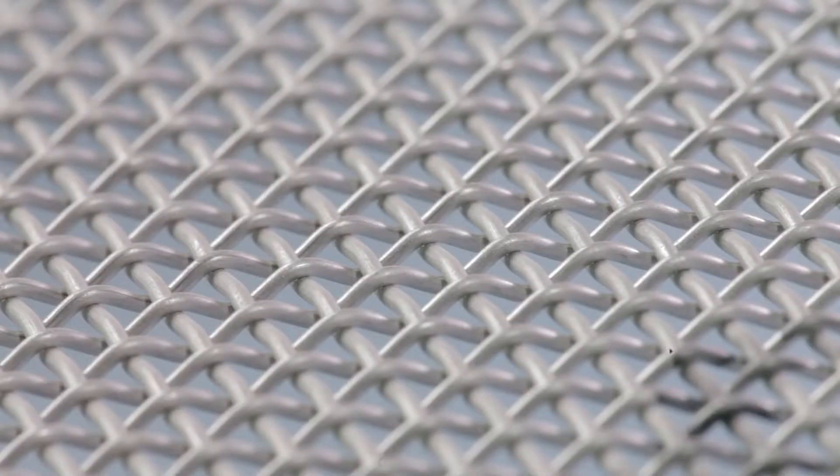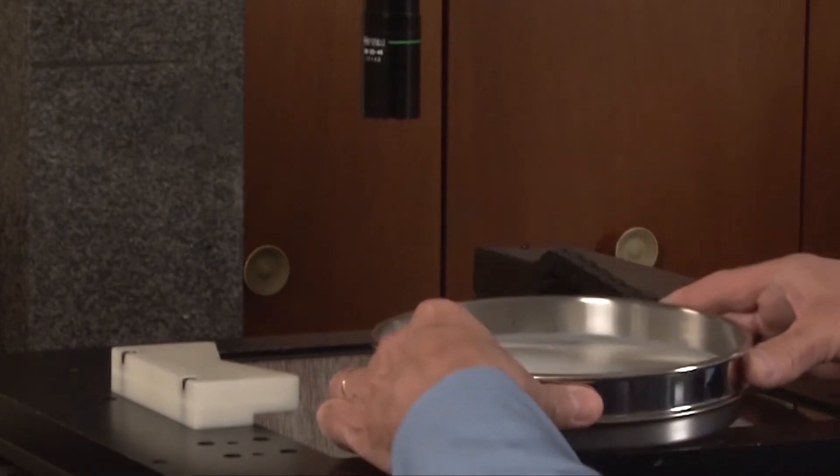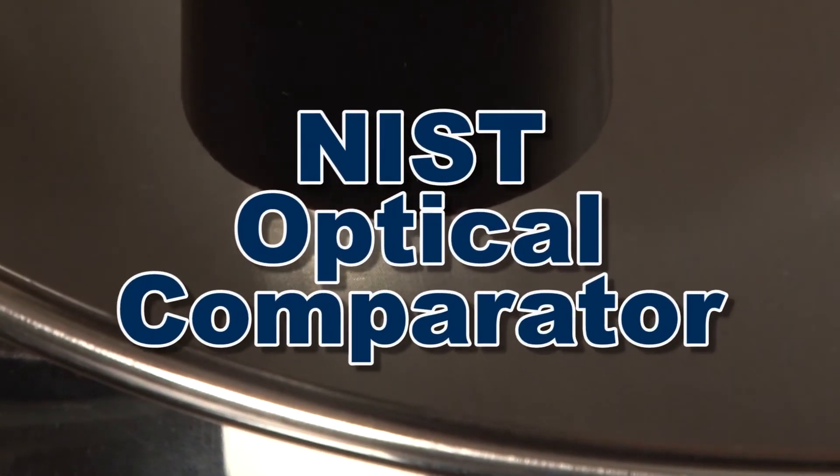Current ASTM E11 requirements for test sieve and screen trays specifies the way the mesh openings are evaluated. Following these guidelines, Gilson's verification service individually measures each new test sieve or screen tray with an NIST traceable optical comparator.